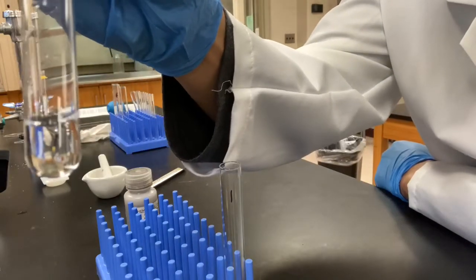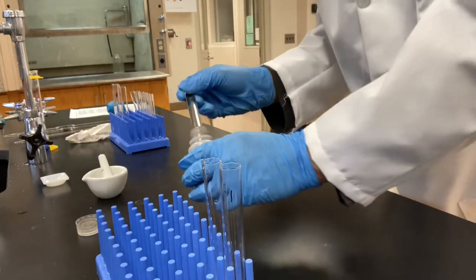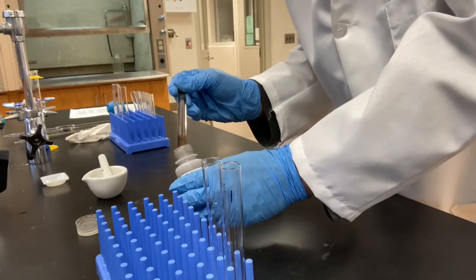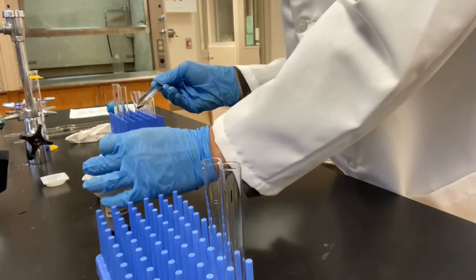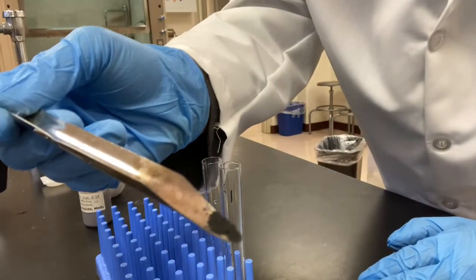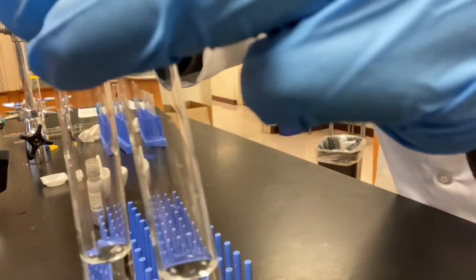This is hydrogen peroxide by itself. Let's look at what will happen if we add some catalyst. I don't need too much, just need a little bit. This is how much I'm gonna add, just the tip of the spatula. The first one, number 1, the second one, number 2. I'm gonna add to number 2.